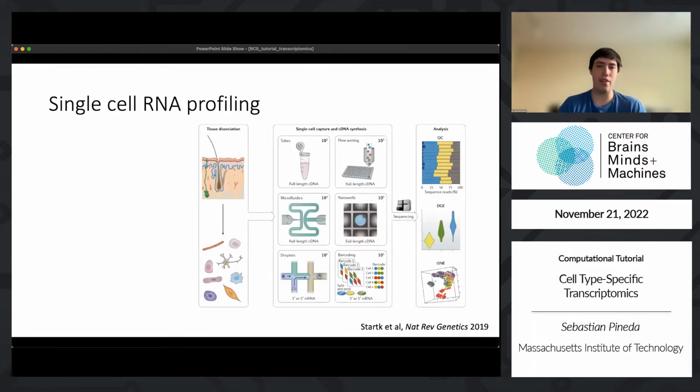All right, on the other end of this is a technology that took off sometime in the last 5 years, single-cell RNA sequencing, and there are many different ways of doing this. In a sense, it predates technologies like TRAP, because you could just flow cells before that, although, as I mentioned, it was not an ideal experiment. Nowadays, a lot of these technologies rely on microfluidics.